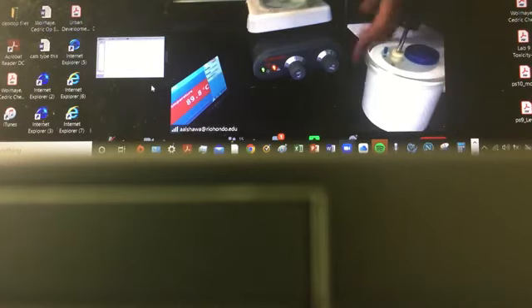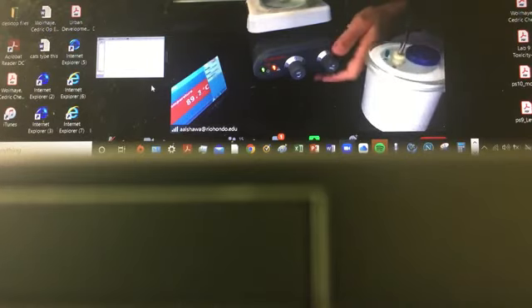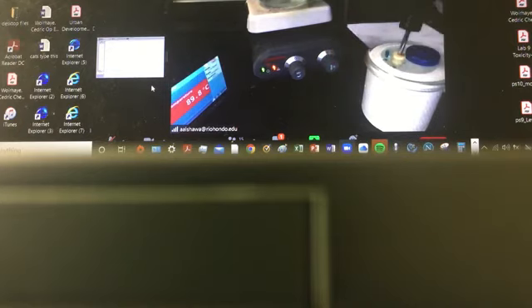I guess there's a cooling time. So I got 9, but then I guess it cooled down a little bit. Even the temperature inside the calorimeter warmed up a bit. Temperature went up from 21.3 to 21.6. So it's 90. Let's monitor that 90.